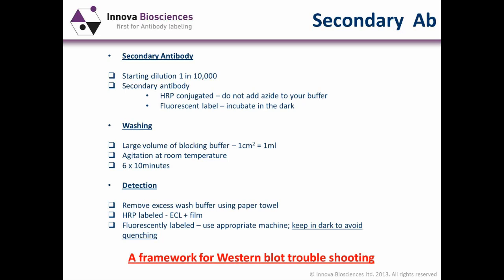I went from way back in my early PhD, spending 2 or 3 months over a period of time optimizing a blot, to being able to optimize an antibody towards the end of my postdoc within about 2 or 3 days, and that's by having this framework in place. That's how I really benefited from it. I saved myself a lot of time.